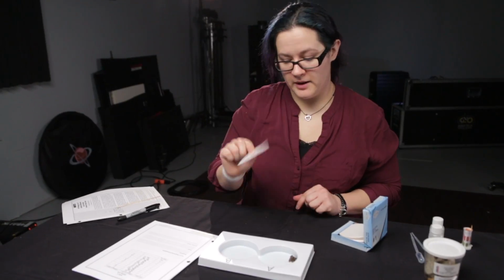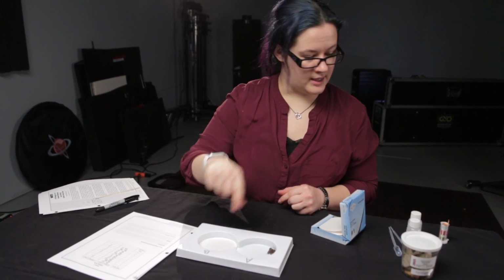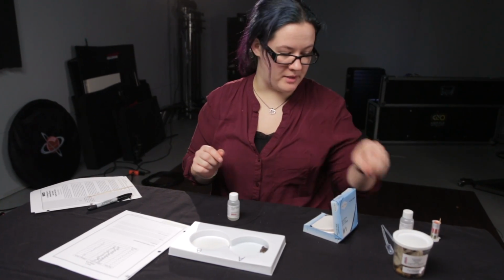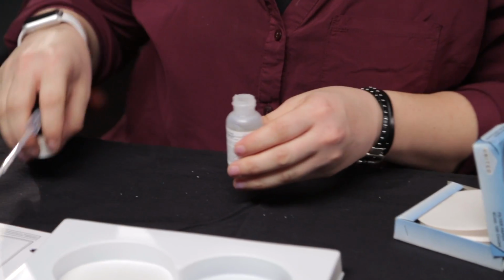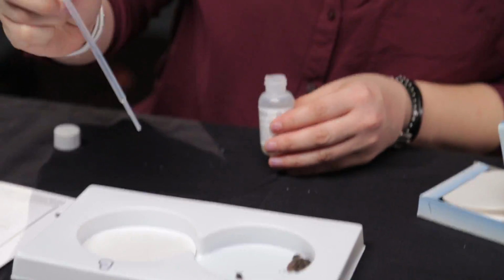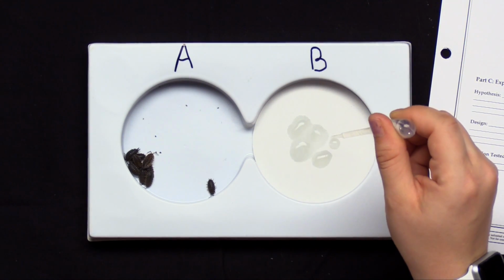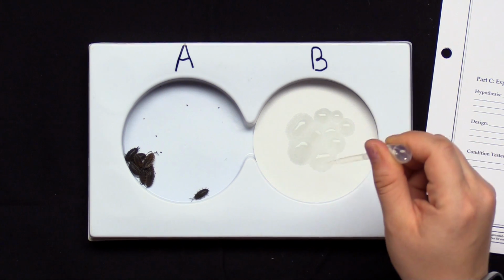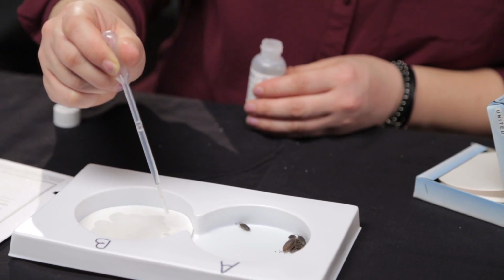I have some filter paper here where I'm going to place it into each of the little containers. And I'm going to put a few drops of a base, potassium hydroxide. Bases are generally things that have a soapy feel to them. And the couple drops that I'm going to be placing are not going to harm the animals in any way. As a general rule in experiments, we don't want to cause harm to our animals. We just want to stimulate them to change their normal behavior.